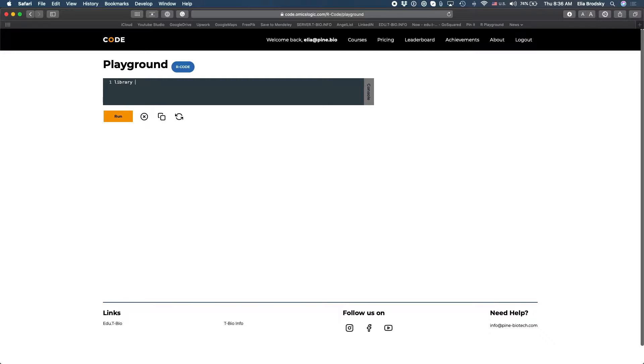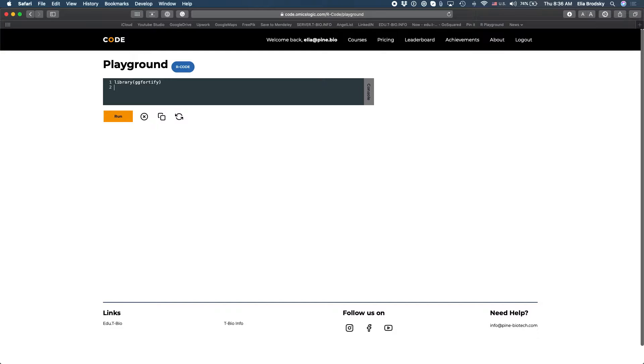A library contains a lot of different functions that are going to be useful and here we're going to use a library called ggfortify. So this library will allow us to run principal component analysis in just one line and then we'll use an autoplot function to visualize our results.